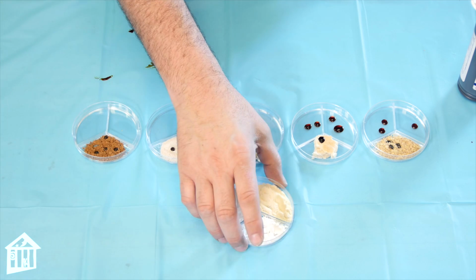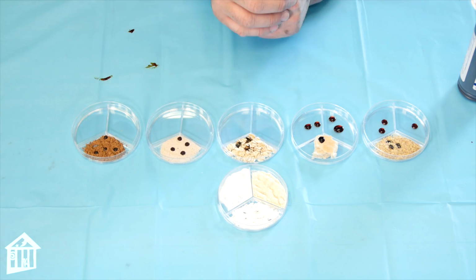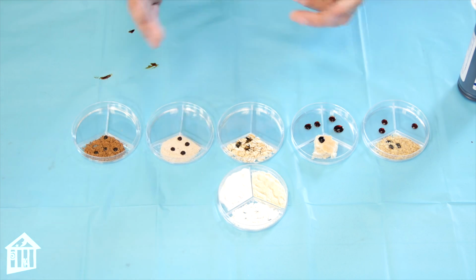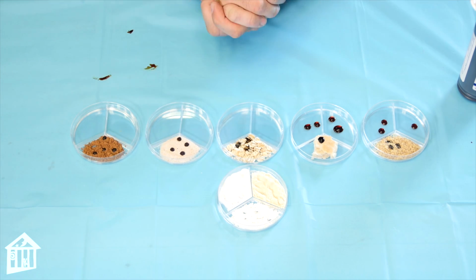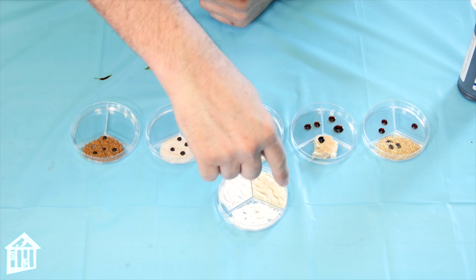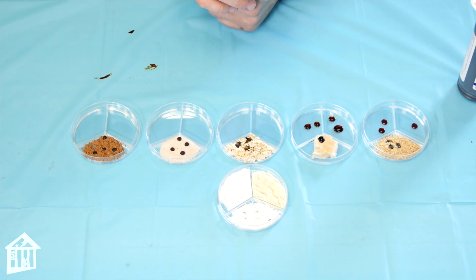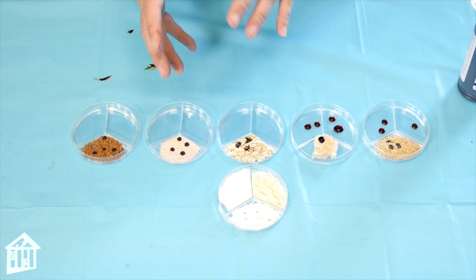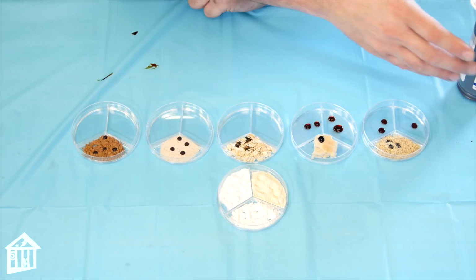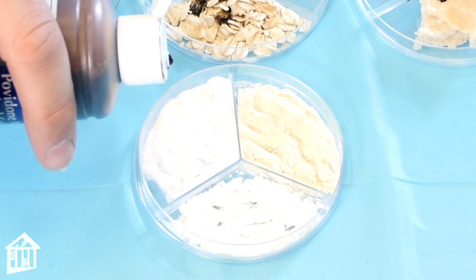So what does this one mean? Let's say you were a detective, like a forensics detective, and you were helping to solve a crime and you found different powders at this crime scene, or you found a single powder at the crime scene. What you can do as a forensic detective is put all kinds of powders into a 3 petri dish and test them just like we test them. So if we're testing for starch, they would look for something that would turn it bluish black. So let's go ahead and see if any of these change color.